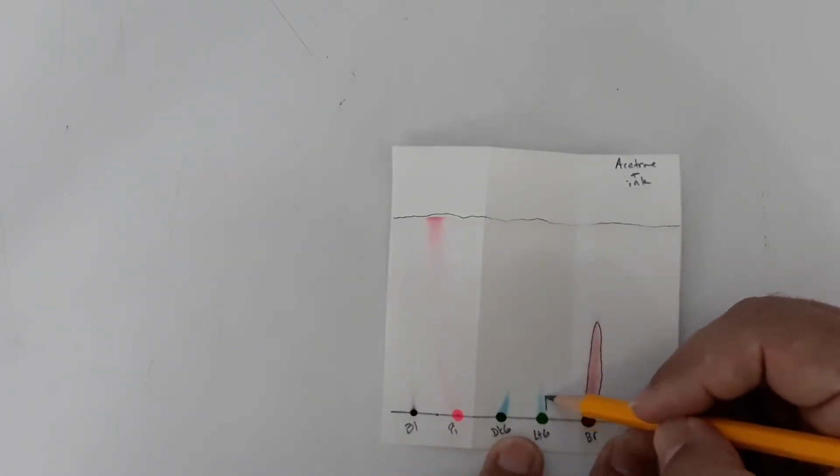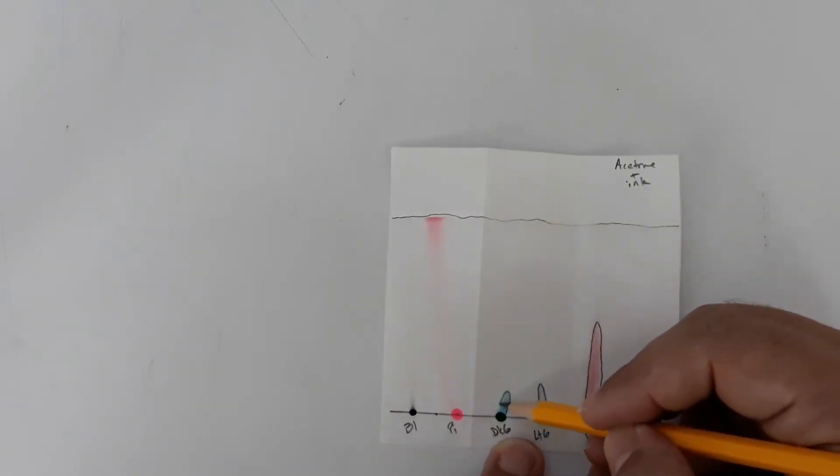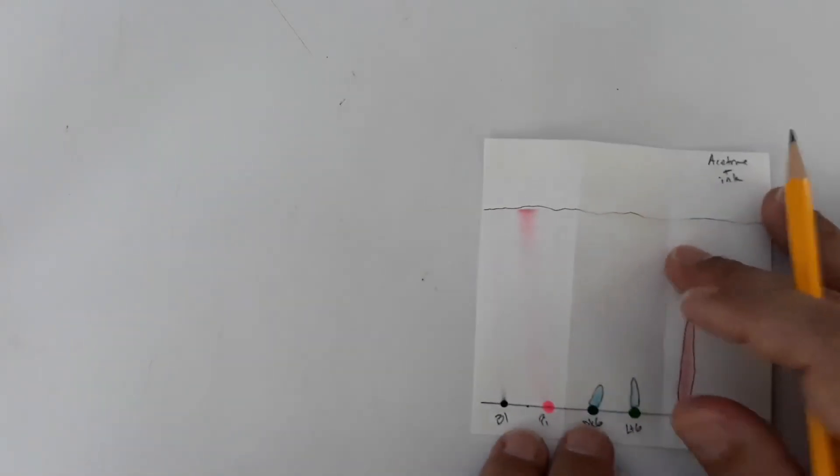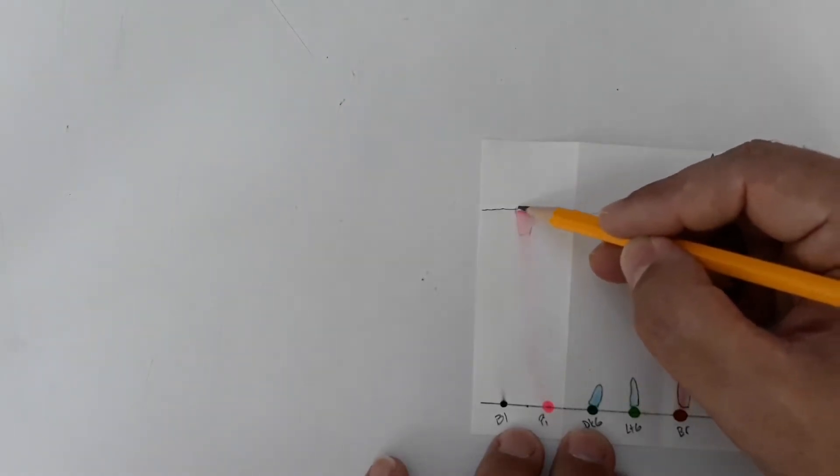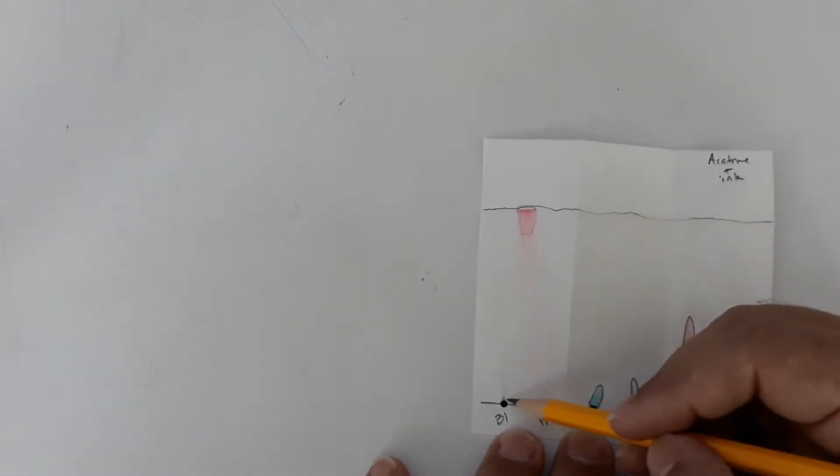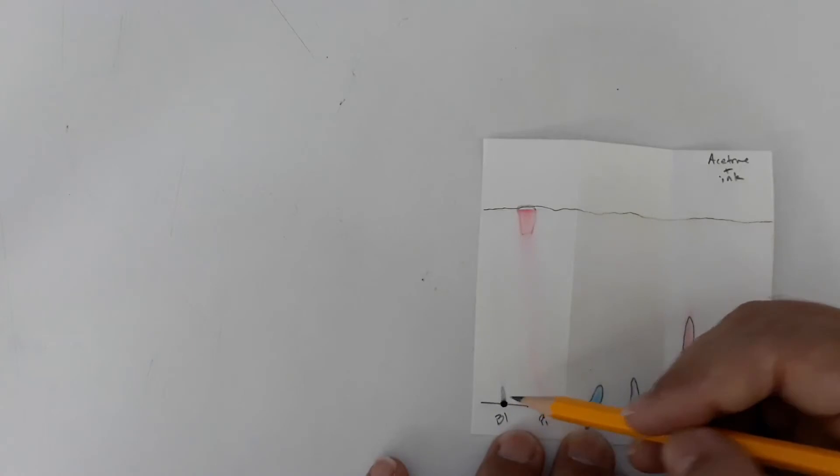So we have our brown. We have just a little bit of blue coming out of each of the greens. Pink gives us this nice spot down at the bottom and then way up near the solvent front right at the edge of it actually is another blotch of pink. We trace that and then black just has this little bit of black here.